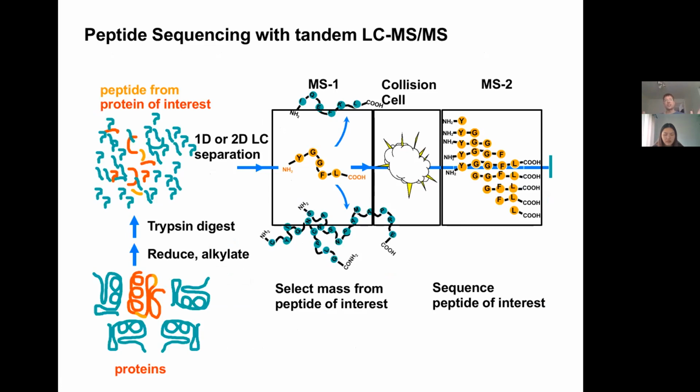And I just told you that you're going to inject peptides, but when we are injecting peptides, and especially complex mixtures, there is a very standard workflow in all proteomics experiments. So I'm going to take us now from a mixture of complex proteins to how we get to good proteomics data. We take proteins, and the first thing that we do is denature them. Urea buffer is super common. Then we reduce the disulfide bonds using DTT or TCEP or something like this. So you break the disulfide bonds.